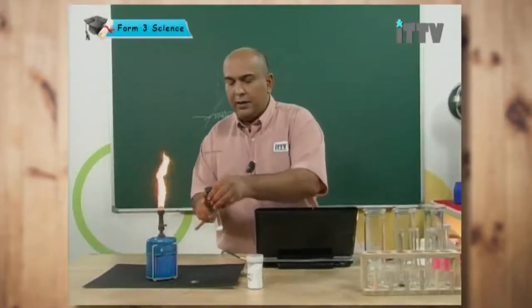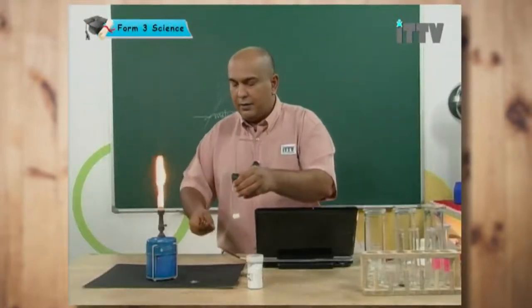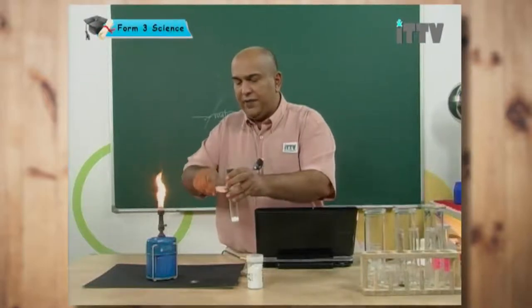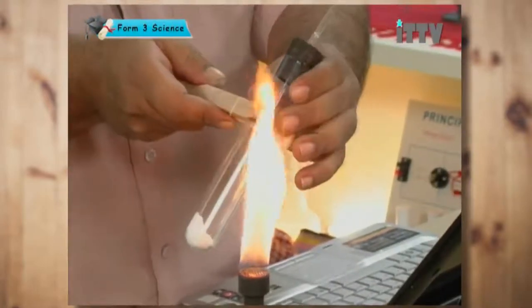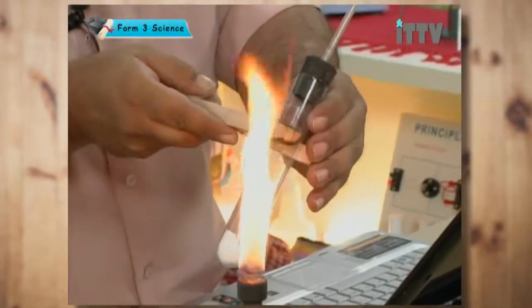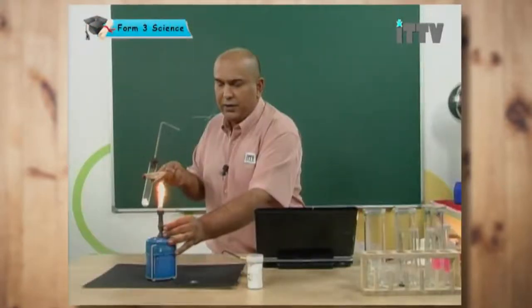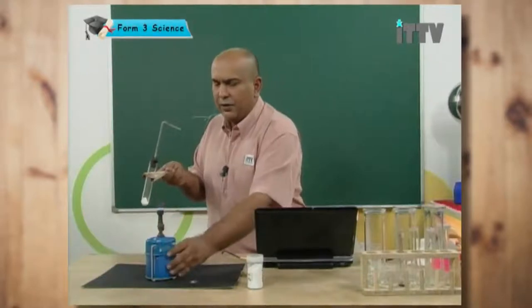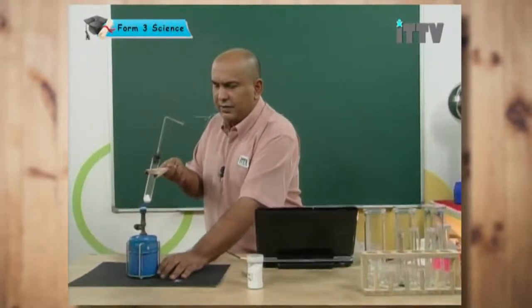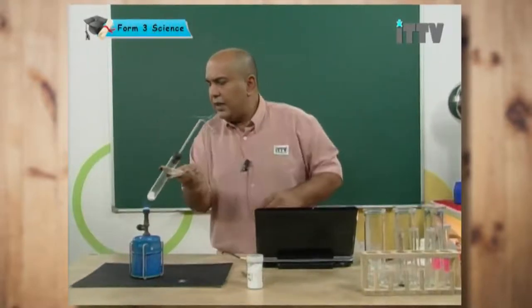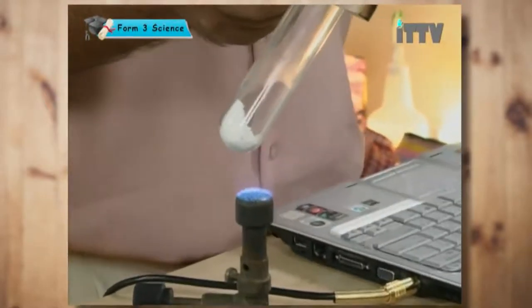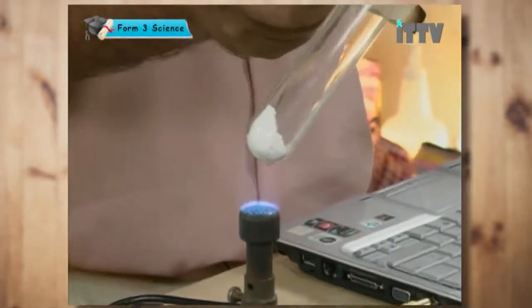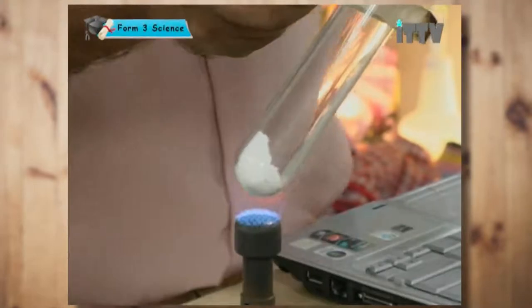I'll get my tongs so that I can hold it safely and clamp it in there. Now, as I heat this up, I'm going to test it. Just turn this back to a solid blue flame. We're going to heat this up and test it to see if any gas or any bubbles come out.